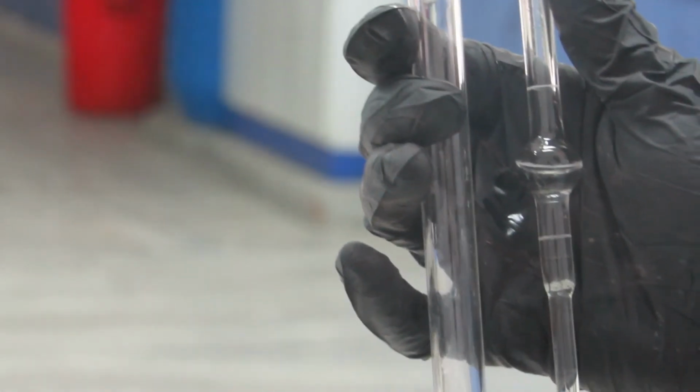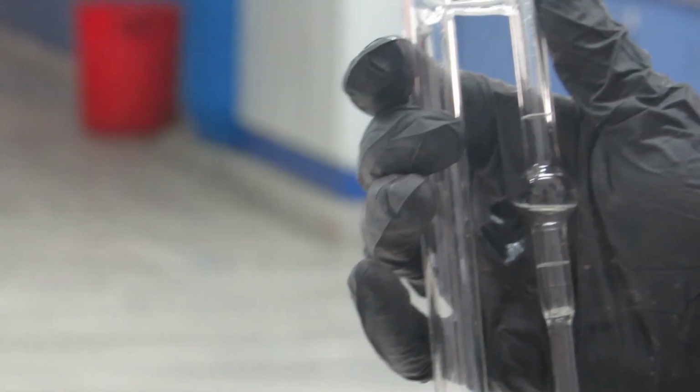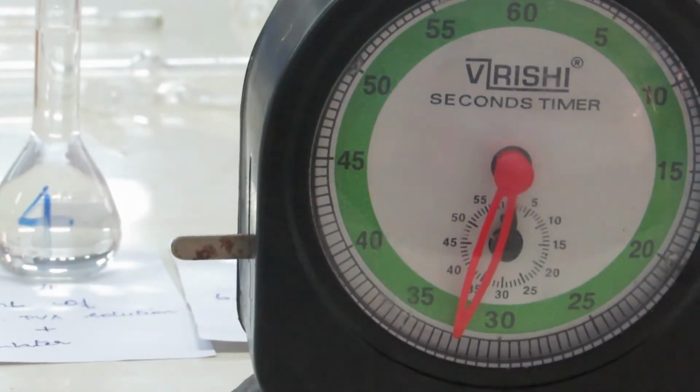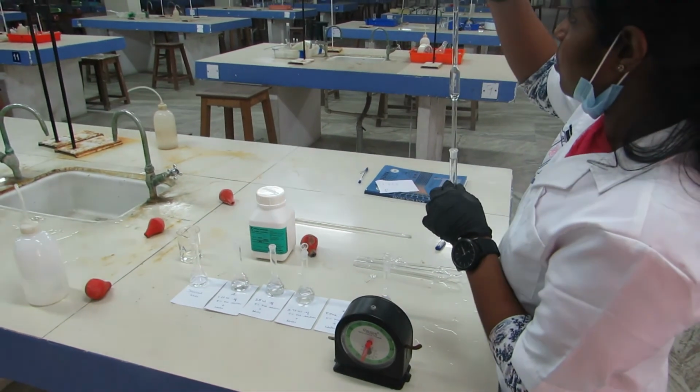Okay, two marks are there. Now the liquid is flowing. At the bottom, the capillary tube is there. That means it is flowing through the capillary. Now exactly whenever the solution reaches that mark, we have to stop our stopwatch. Once you stop it, you have to note down the time in seconds. Sometimes it will cross even 60 seconds. That means you can write it in minutes and seconds.